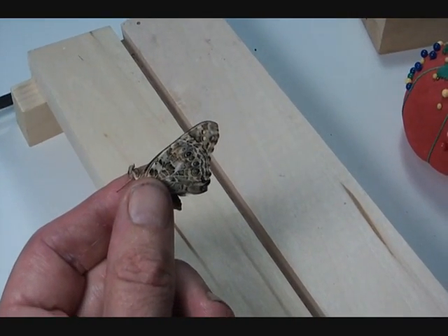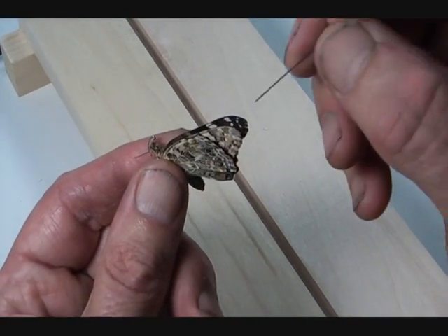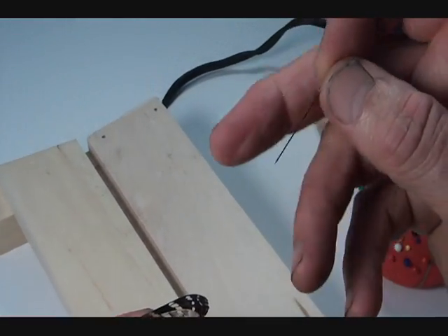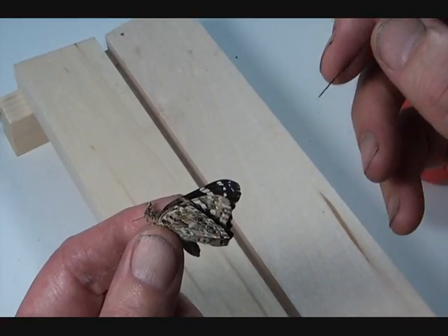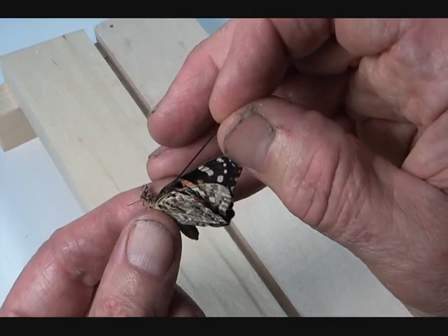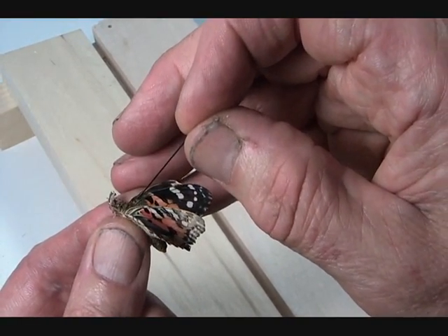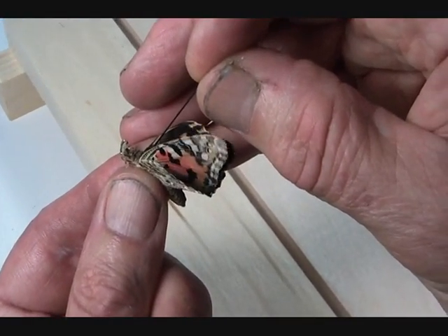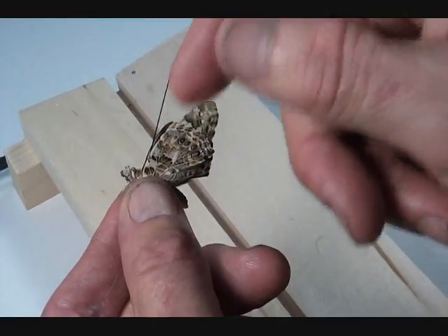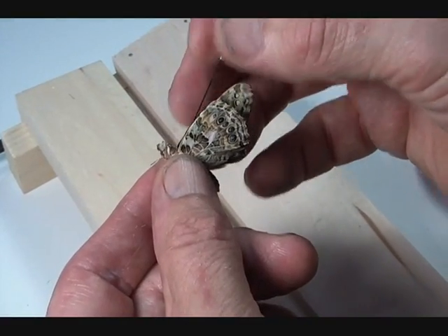You grab it like this, doing minimal holding of the wings so you don't scrape off the scales. You get a pin of appropriate size — it should be reasonably stiff. For this one you'd use either a number two or number three pin, something reasonably stiff and not huge. Then you can spread the wings a little bit and pierce it straight down through the thorax so that the pin is perpendicular to the body and perpendicular to the long axis as well.